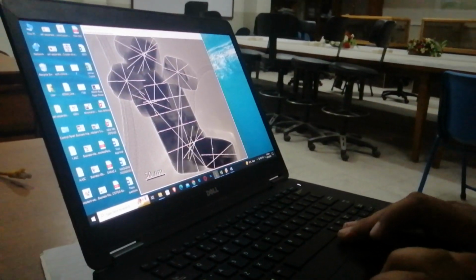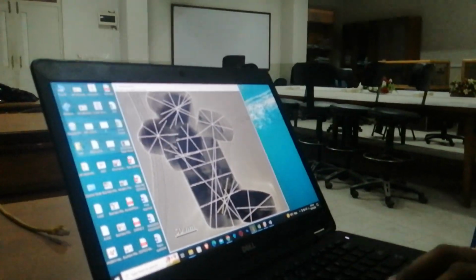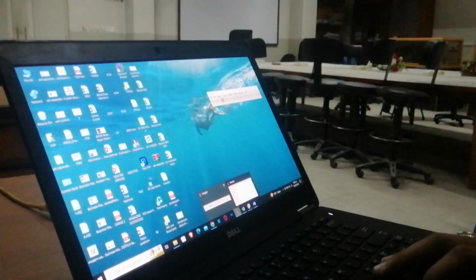Assalamu alaikum. Today we are going to find particle size, and Mr. Junaid will help us in finding particle size from TEM, transmission electron microscope images. So let's start from here.